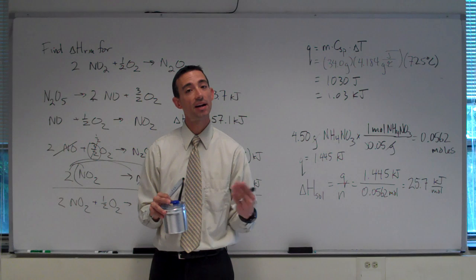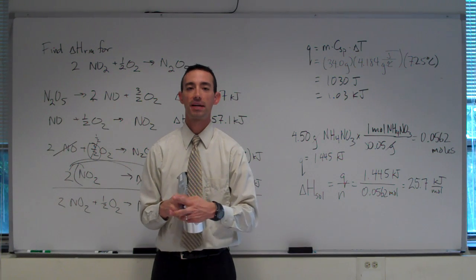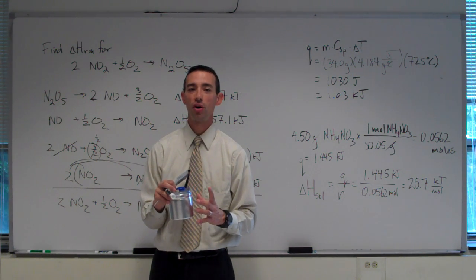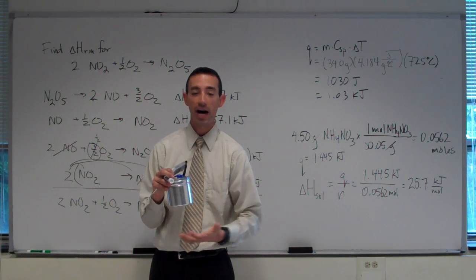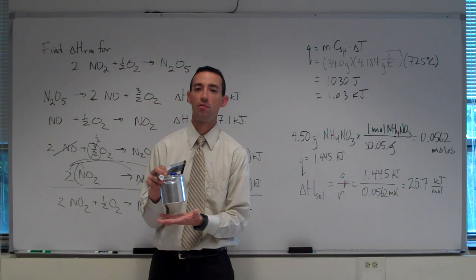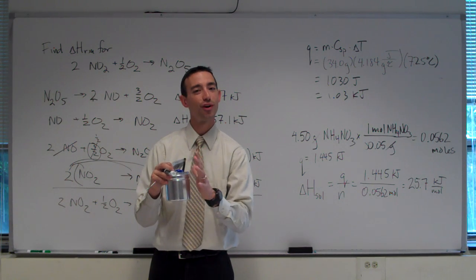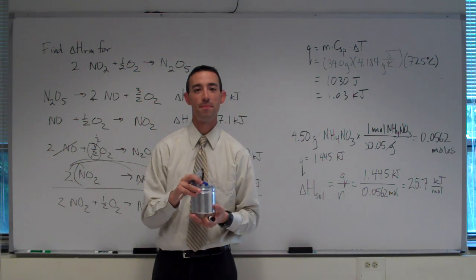This ruins the entire experiment, in addition to being a safety hazard, because if someone doesn't know this is hot and they grab it, that's how they'll get burned. And also, while this is insulated, it can't overcome a hot plate just cranking energy into it from the bottom. And so if you have the hot plate on, you'll certainly be violating the first law of thermodynamics for the interior contents of this experiment.